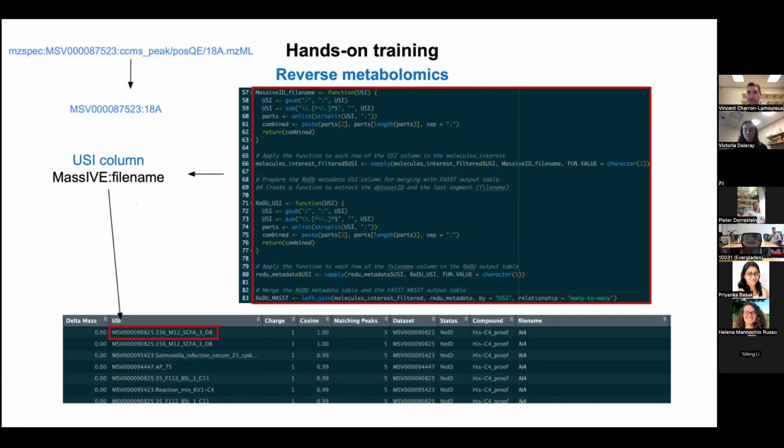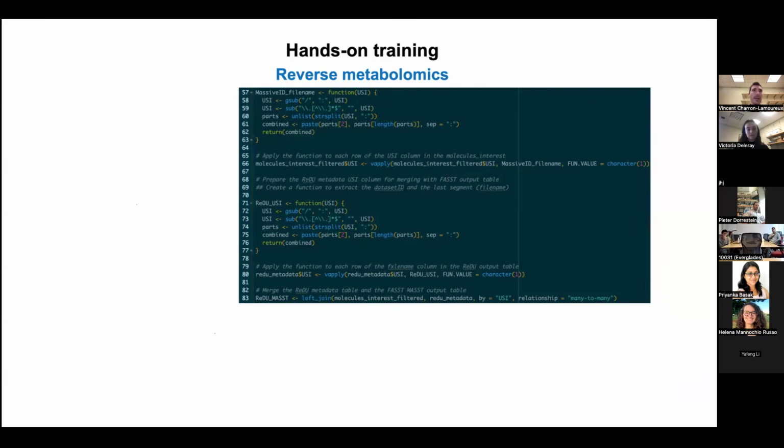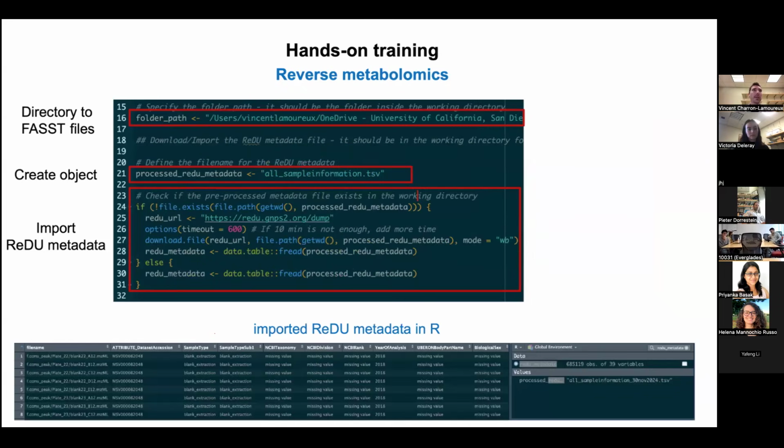Okay. And so for the working directory, we direct everything to the folder that we just created to put the CSV file, or the zip folder that you just sent us. So the working directory, when you choose a directory, should point toward the CMMC workshop folder. And the folder path that you have here should direct to the input folder inside the CMMC workshop that we just also set in the chat.